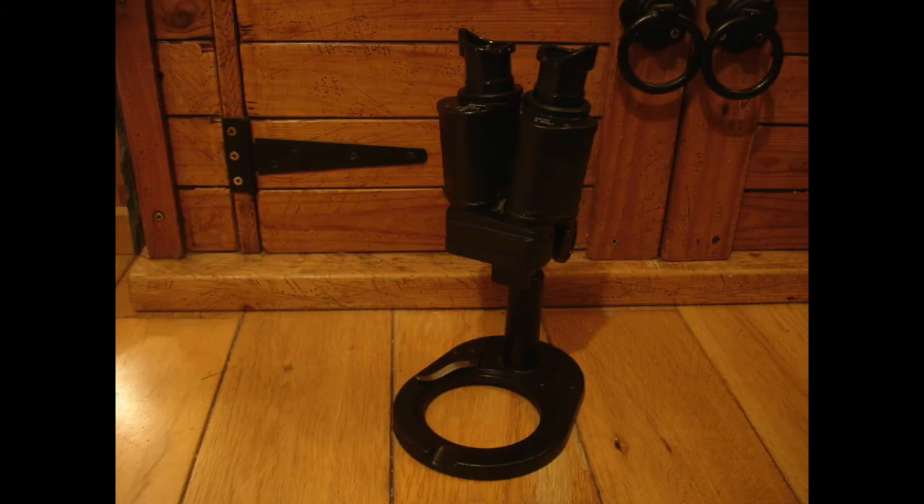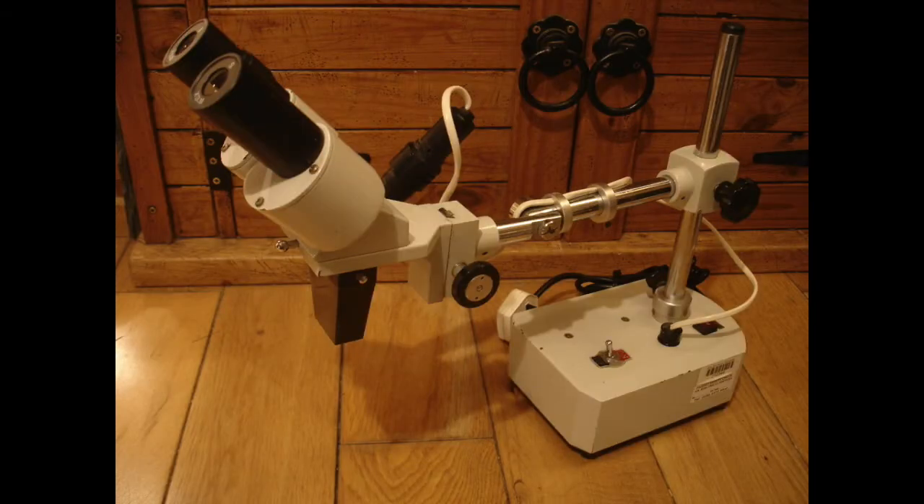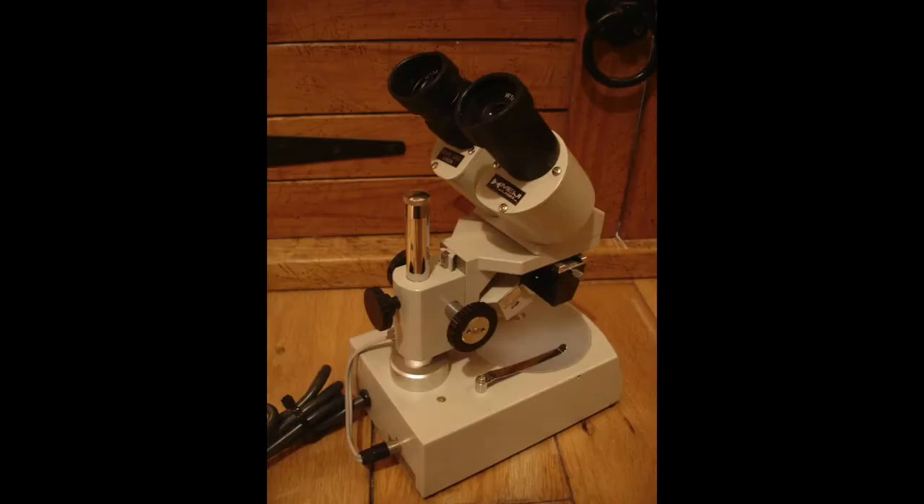I'll talk you through my other microscopes quickly. This is a really basic stereo microscope. Here's another stereo microscope, a small one, but this one's got a ring light on it, which is quite useful. This one is called a long arm stereo microscope — what's useful about this is you can put a big object like a rock on the floor and then swing the arm around and view it.